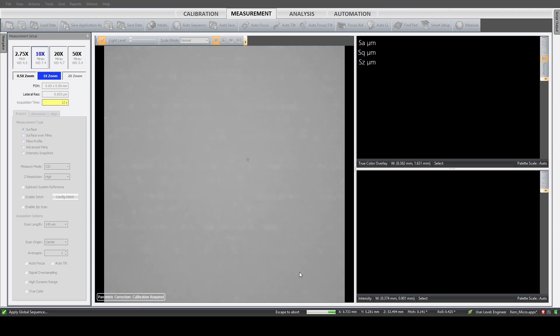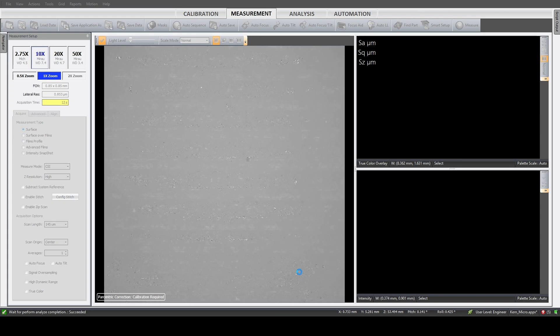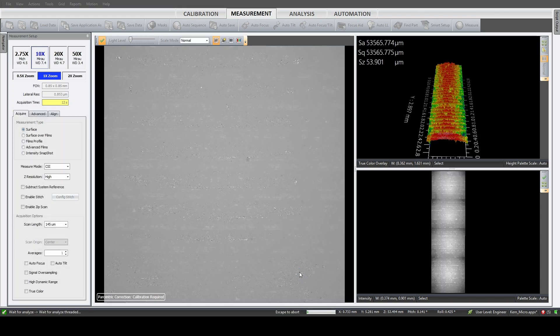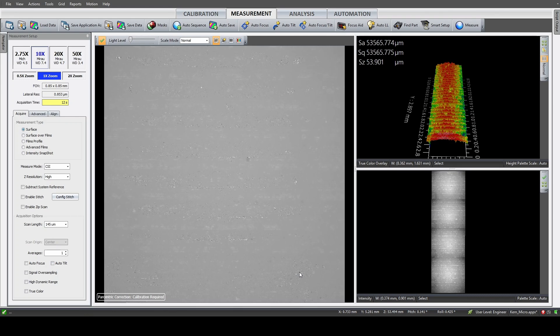We are recording a data set here which consists basically of three coordinates, X and Y, which are predetermined by our scan field, but the real information is in the height. Every X, Y coordinate is attributed a Z height, and because this is a white light interferometer with absurd precision.